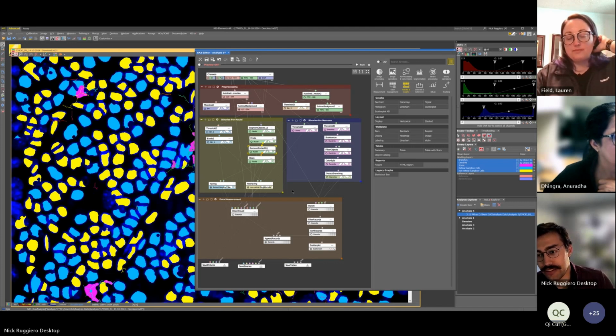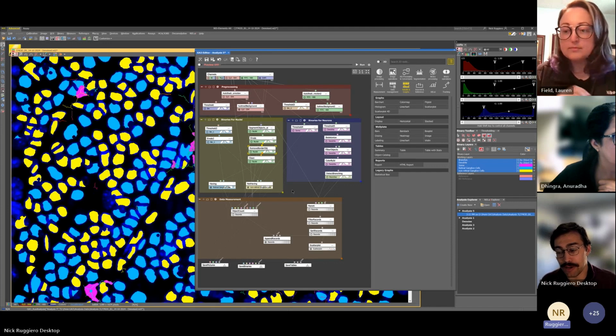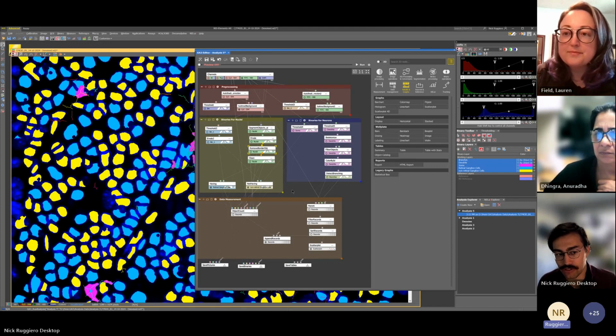Yeah, sure. And again, like we talked about earlier, it's great to give it the best data that we can, but we can't always give it great data. So there are a ton of things that we can do here in order to manipulate the data a little bit and get nice results out of it.